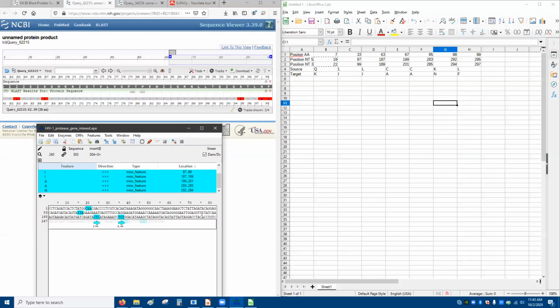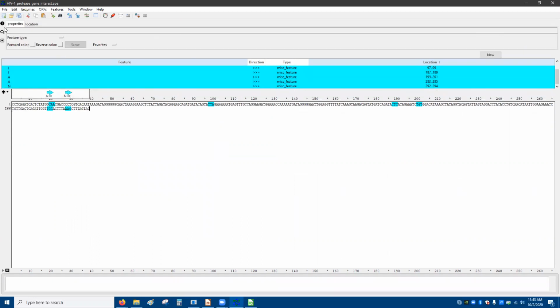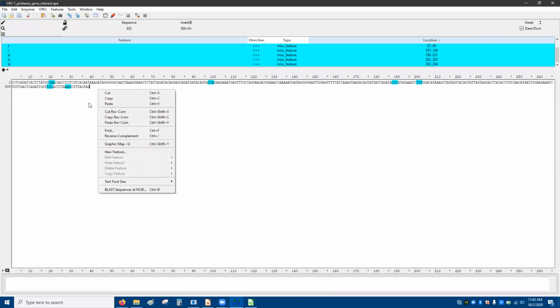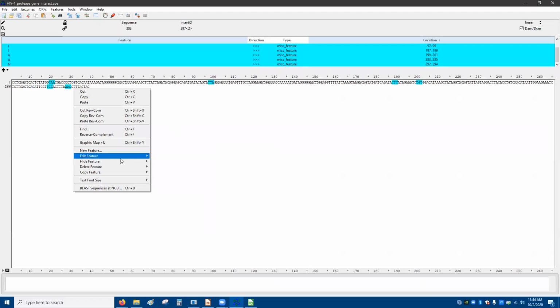Where'd that go? Oh, that's so annoying. I did something and I don't know what. I don't want this. Okay, whatever. I don't want to hide anything. I'll have to go away.